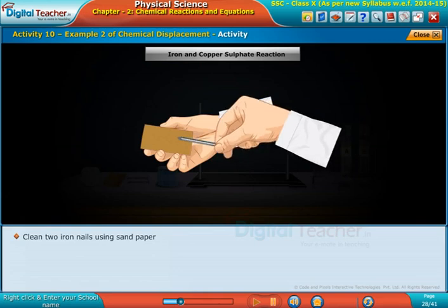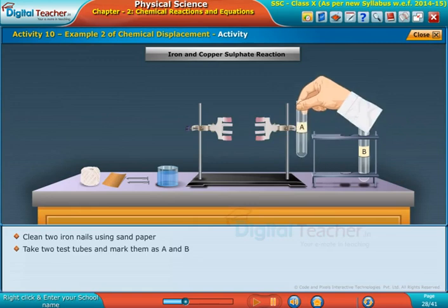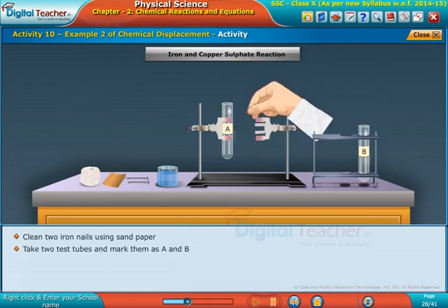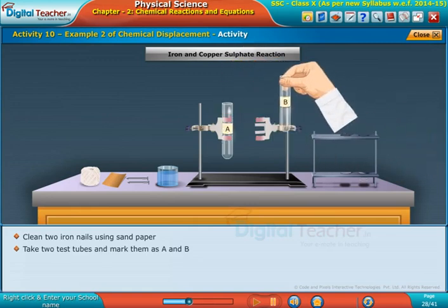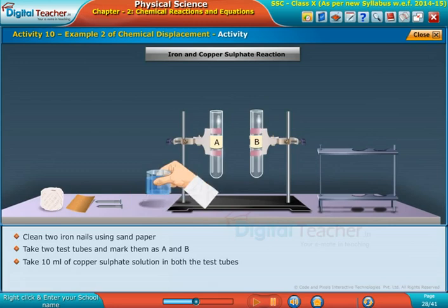Clean two iron nails using sandpaper. Take two test tubes and mark them as A and B. Take 10 ml of copper sulfate solution in both the test tubes.